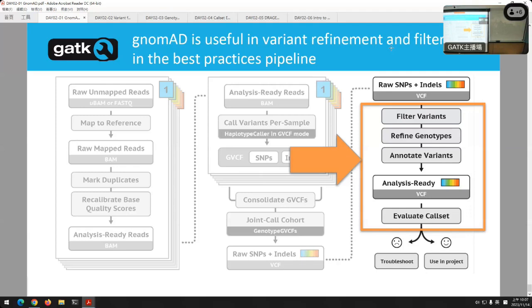Alternatively, if you are a clinician who is looking into that variant as a potential cause of disease, you might go to gnomAD, and you don't want to see that the variant is completely missing, because then you would conclude that's a really rare variant. Instead, you might see that it's present, but it didn't pass filters, and then you might draw a different conclusion. Maybe it's an artifact, or maybe it's a variant that does occur in the population, but just wasn't super high quality in gnomAD. Yes. Okay.